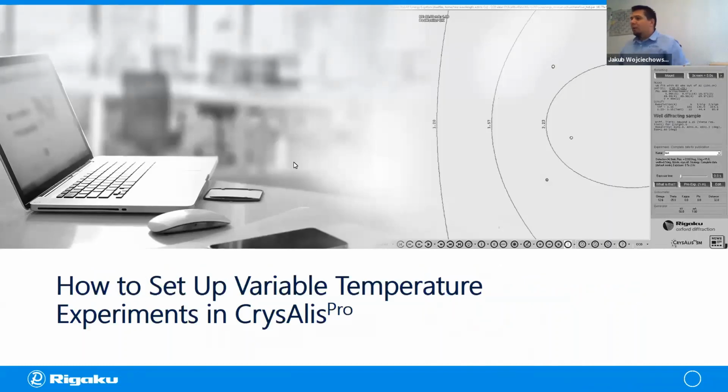Let's start with the webinar. So this webinar will strongly focus on software and how to implement the tools that are built in to CrysAlis Pro for the variable temperature experiments.